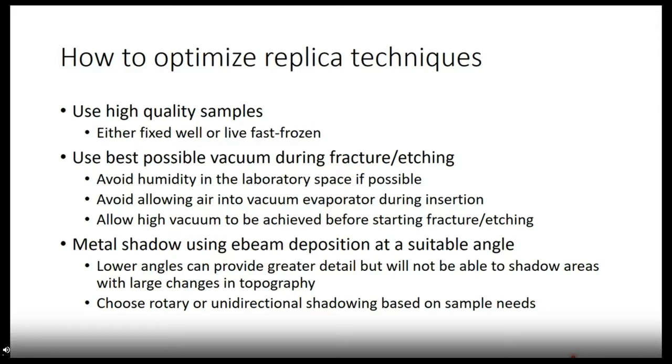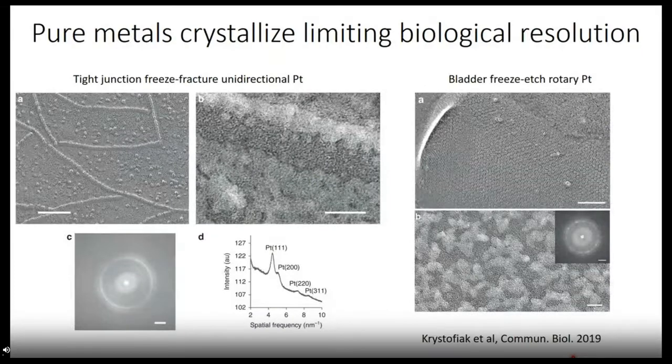All right, so let's get into optimization of replicas for biological fidelity. So we're going to go into a technique I developed to preserve the maximum amount of biological detail, but this is at the expense of contrast. And we'll kind of go through this.